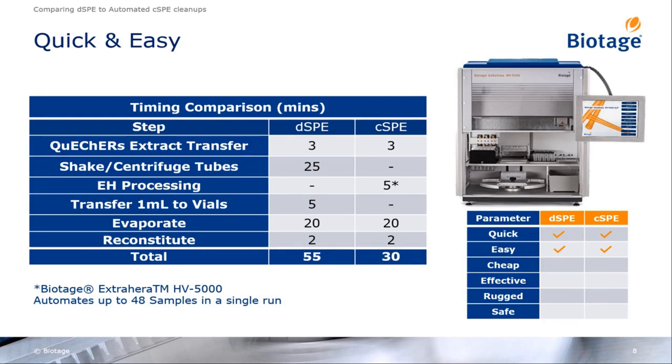So for our first comparison, we evaluated whether either format met the criteria of being quick and easy. And the way this was done was doing a timing comparison for the steps involved to carry out a DSPE versus a CSPE cleanup. And as you can see, each step has its own timing associated with the format being used.